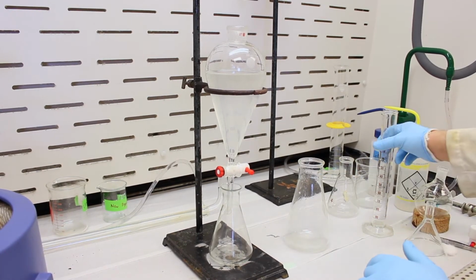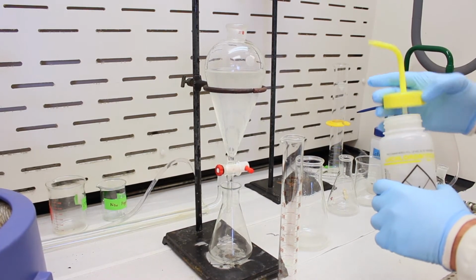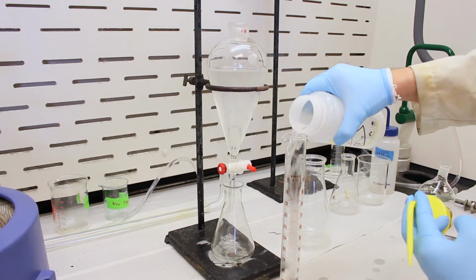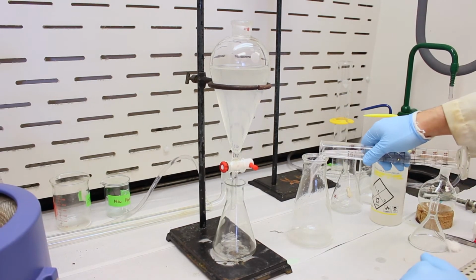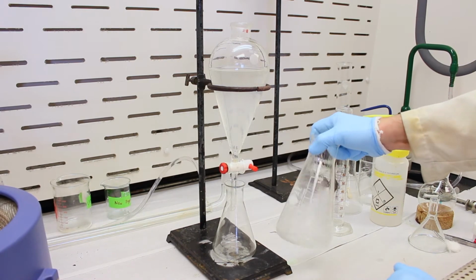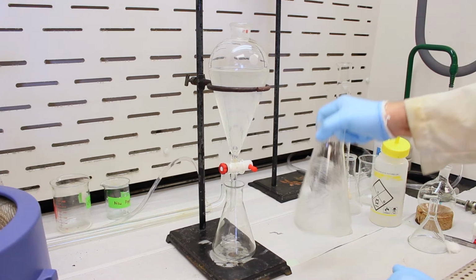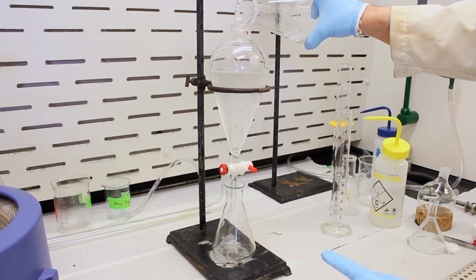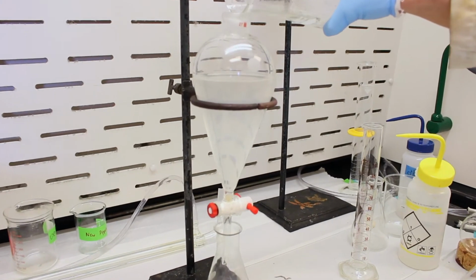And I think what we will do is we will do 3 extractions with about 40 mils of dichloromethane. The exact value is not that concerning, so we'll just roughly measure 40 mils. And we can rinse out our distillate flask to get all of the eugenol out, so give that a little shake. Okay, and when I add this DCM, because the DCM is more dense than water, it'll go towards the bottom, and it will form a separate layer.